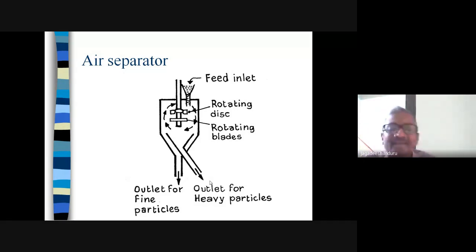The advantage of this mill is not like your Cyclone separator. It does not require anything in the fluidized state. Just like simply powder mixture you can put in the hopper. Hopper is like a funnel-like structure. We call it a funnel in the small lab.